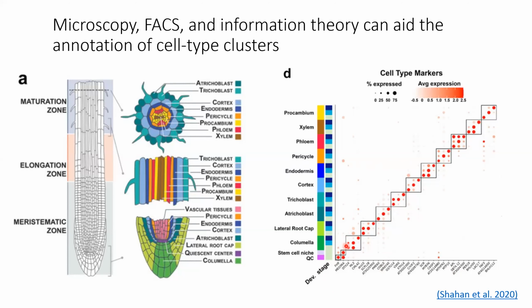And you also notice that marker genes have stronger expression within these boxes, as is expected, but marker gene expression does not always fall neatly into the discrete cell categories. It's more the exception that's what we observe.